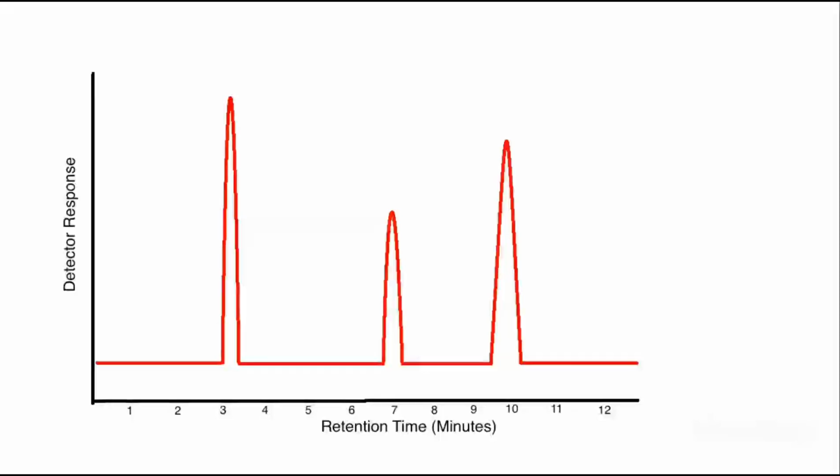Now the question becomes, if you have a printout like this and you know you have 3 different compounds, which compound is going to be which? Let's use, for a generic example, X, Y, and Z. So you have 3 compounds in a solution, labeled compound X, compound Y, and compound Z, and you need to figure out which one relates to which peak. You do this by boiling point. Whichever one has the lowest boiling point is the one that would go into the gas phase first, so it's the easiest one to transition from a liquid to a gas.